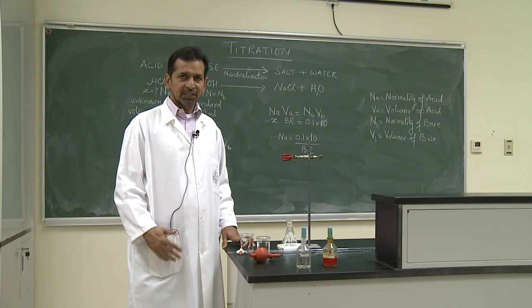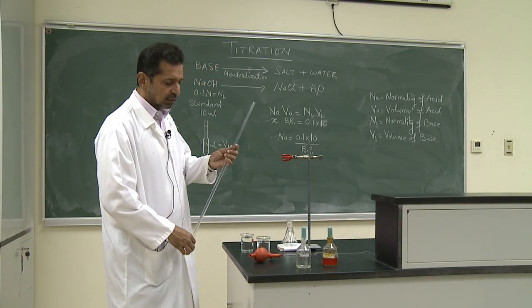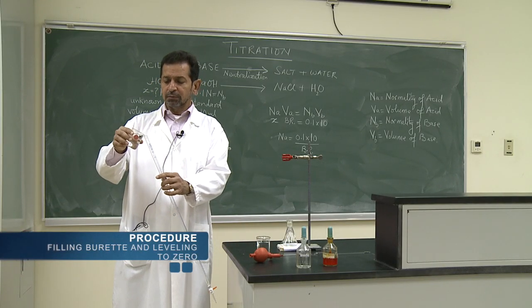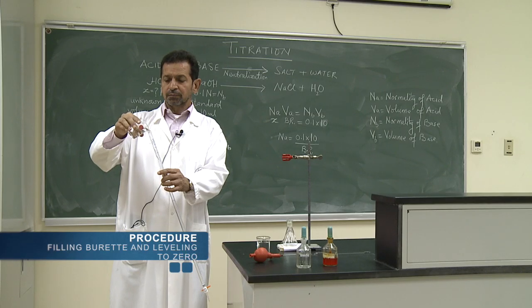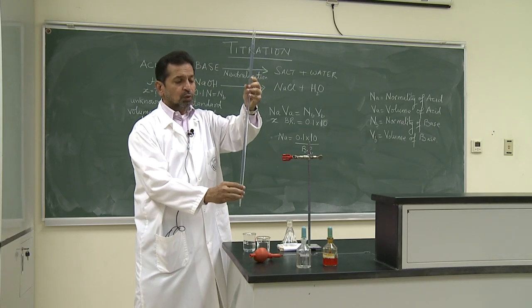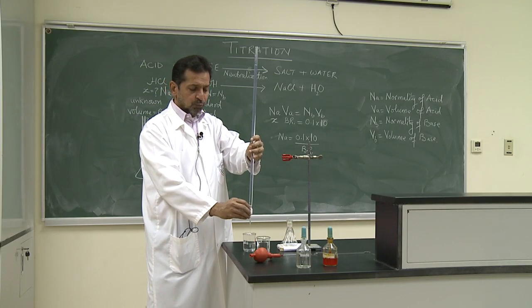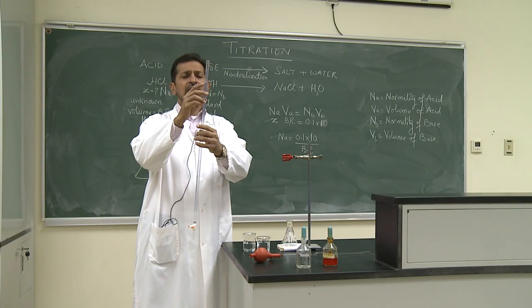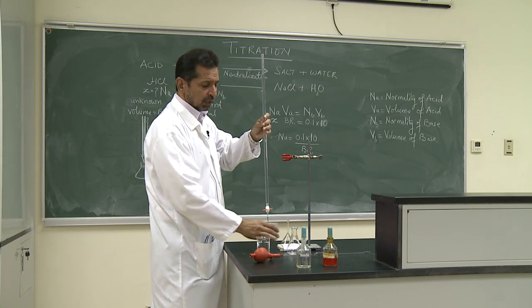After washing and rinsing, the next step is filling the burette with the acid. We simply pour the acid into the burette. After filling the burette, we have to remove the air from the jet by opening the knob completely and passing the solution through the nozzle. Doing this may lower the level of acid, but it should still be above 0. After filling, we need to set the level to exactly 0.